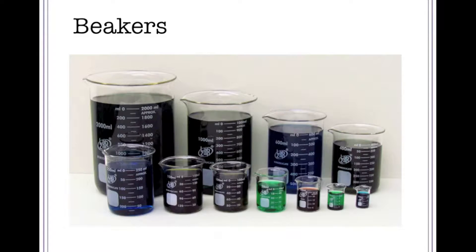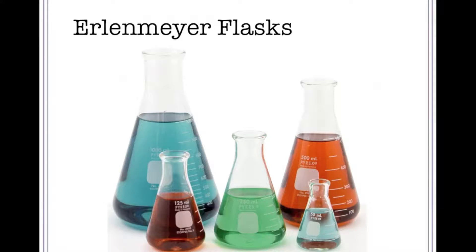Beakers are used for mixing and heating solutions and come in a wide array of sizes. An Erlenmeyer flask can also be used to mix a solution and comes in a wide array of sizes. Unlike a beaker, an Erlenmeyer flask can be stoppered and the solution inside stored.